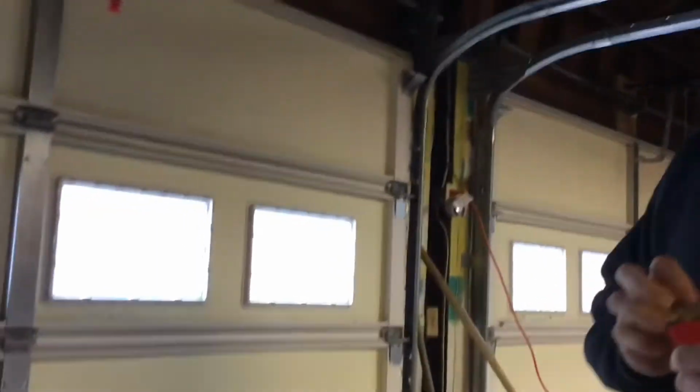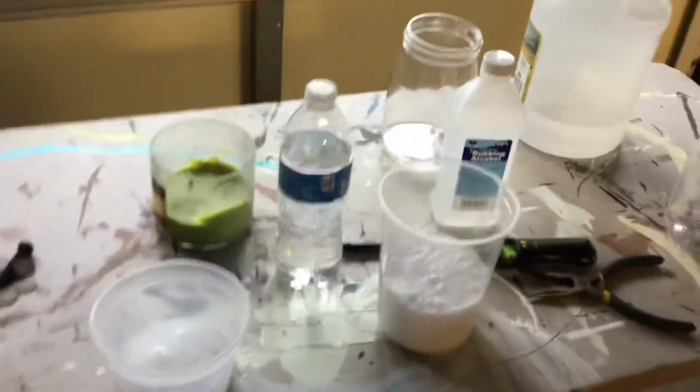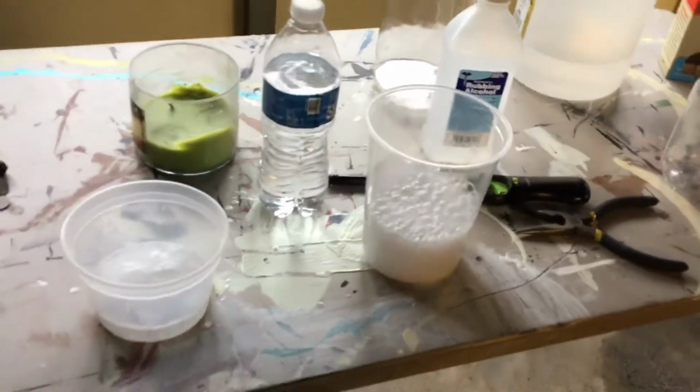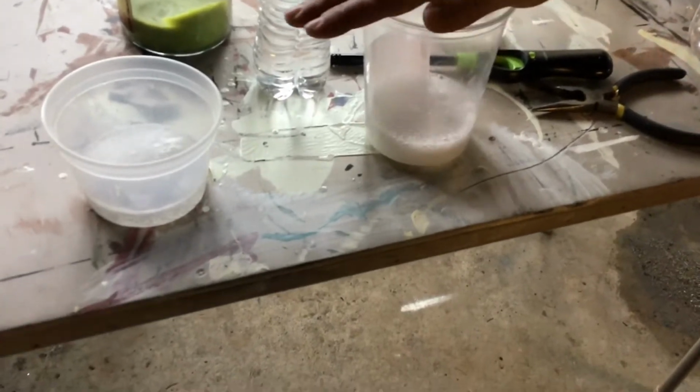But I'm going to show you that I can prove to you that the gas is formed, and the gas is clear. So this is baking soda. You probably have this in your kitchen. When I react it, you get lots and lots of bubbles. The bubbles being given off here are also carbon dioxide gas. Now, what I'm going to do is just put my hand over that, because that carbon dioxide gas is heavier than air. So one of the neat things about carbon dioxide gas, it stops combustion.